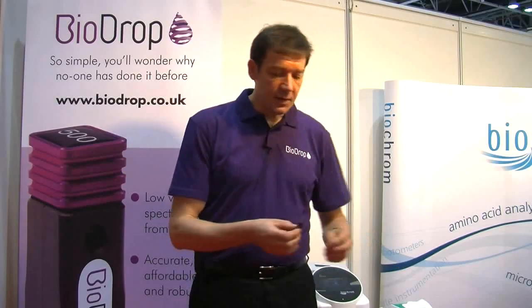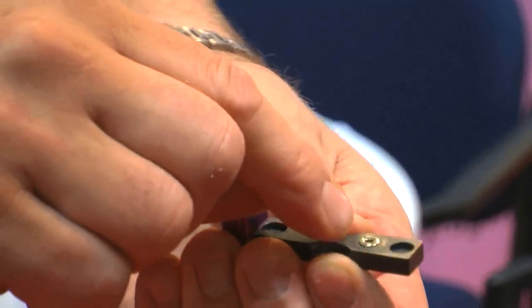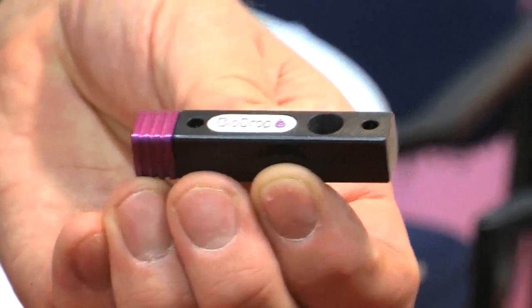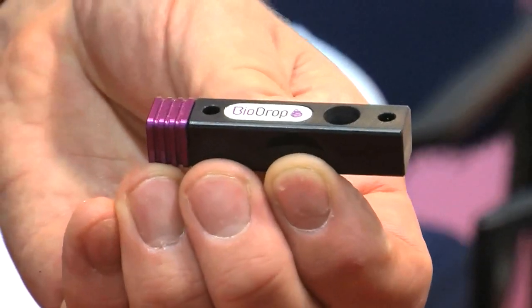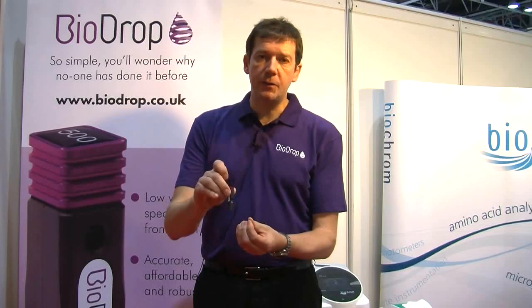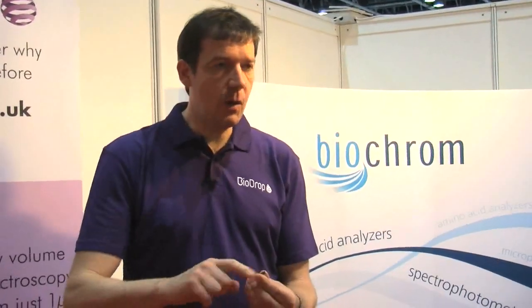The device simply opens up like this, you can pipette down onto the small target area here, and in closing it up it's held magnetically. The unique patented diaphragm design actually holds the sample perfectly in place. You pop it in the spectrophotometer, make the measurements, and when you're finished take it out, a quick wipe clean with a dry cloth, and that's the measurement done.